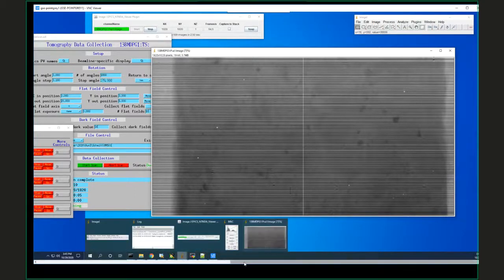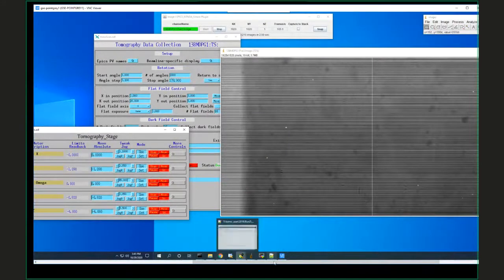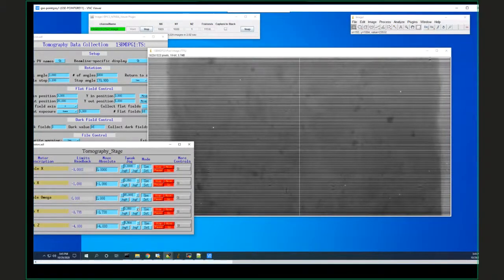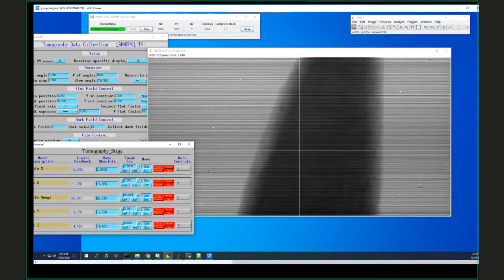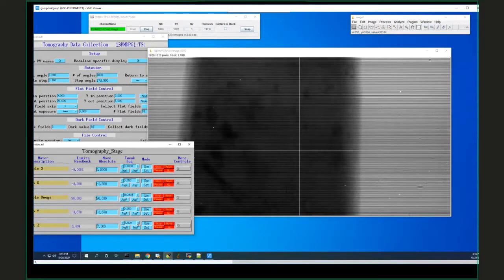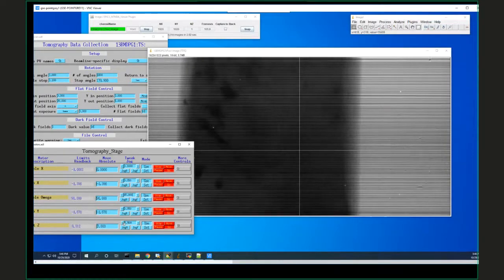Okay, thanks. So now I've put this new sample on. I need to do the same thing we did before in terms of centering it. So this is at 0 degrees. So that's going to be this control here. That looks good. One more, go to 90. Kind of sloped up here, so it's probably better to do this a little further down. That's 90.